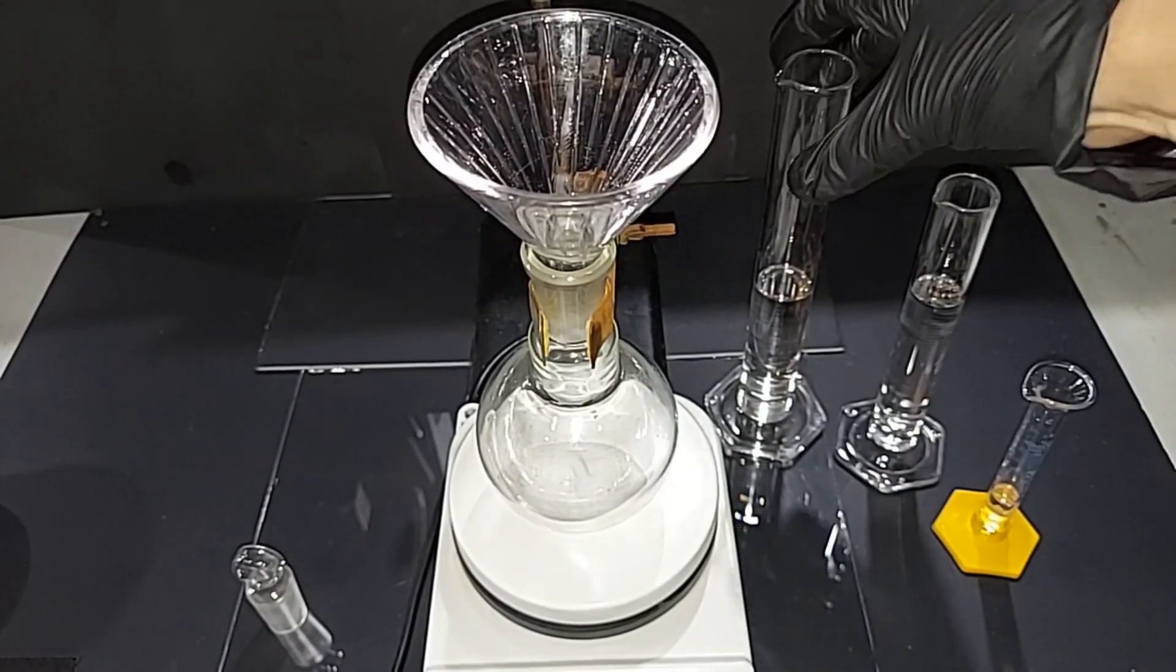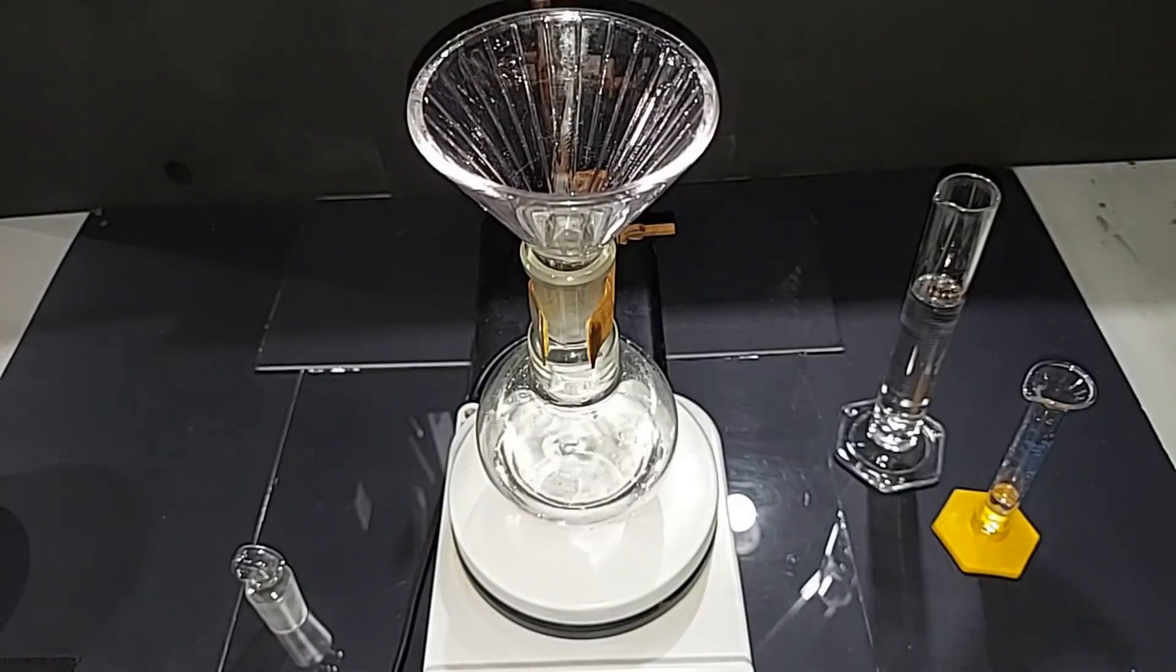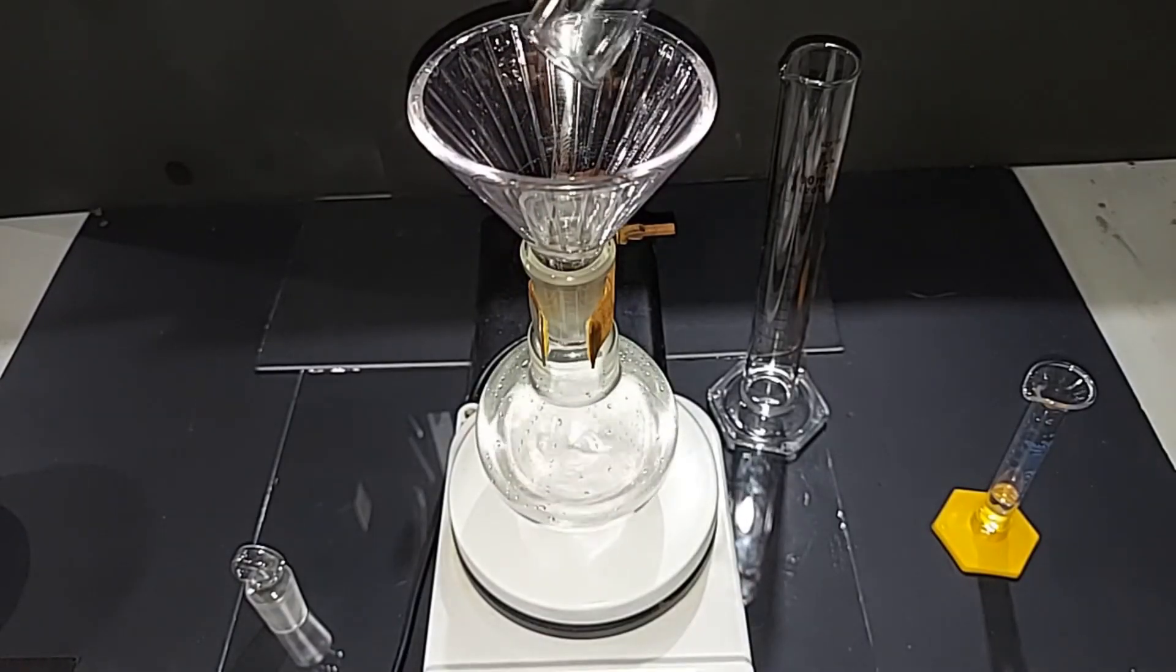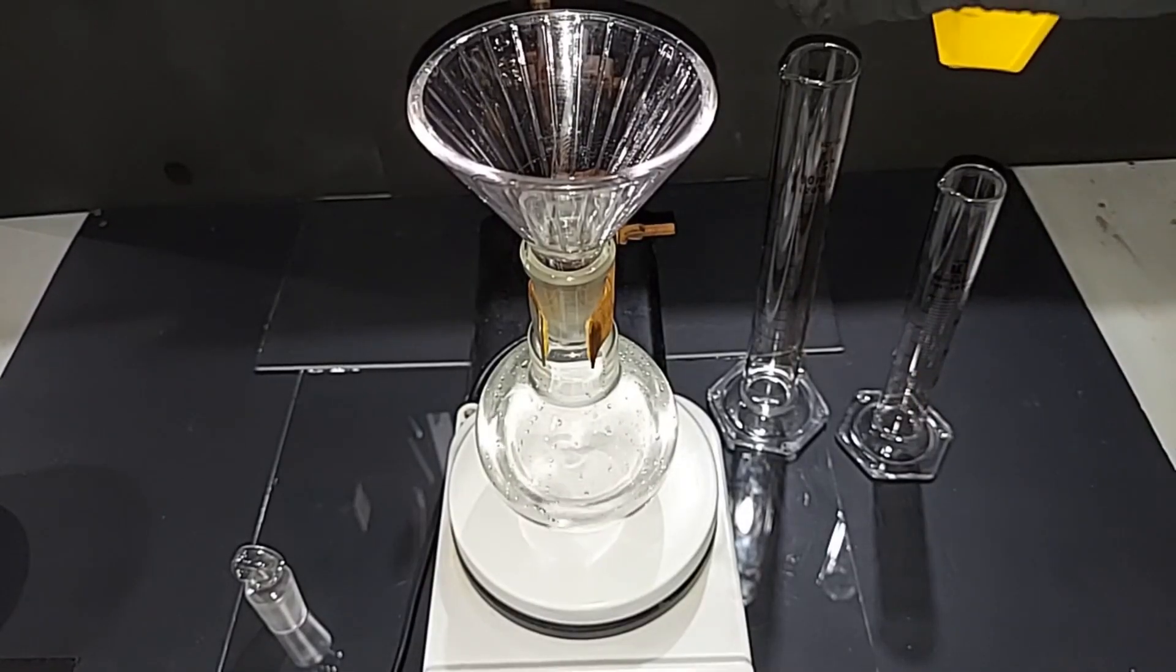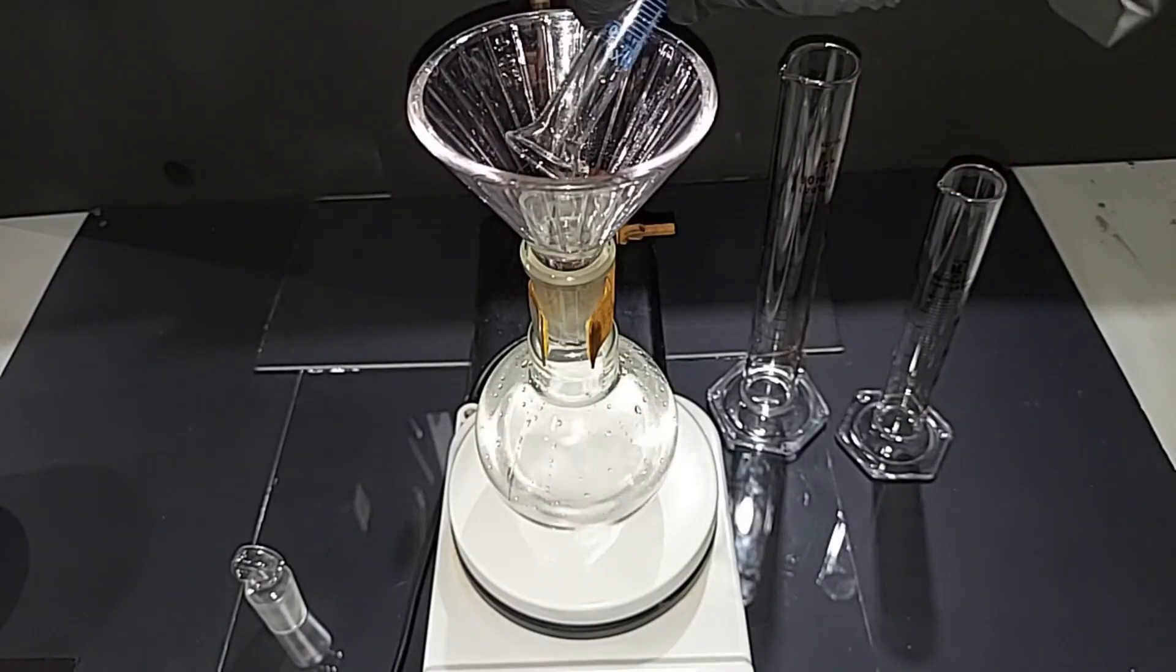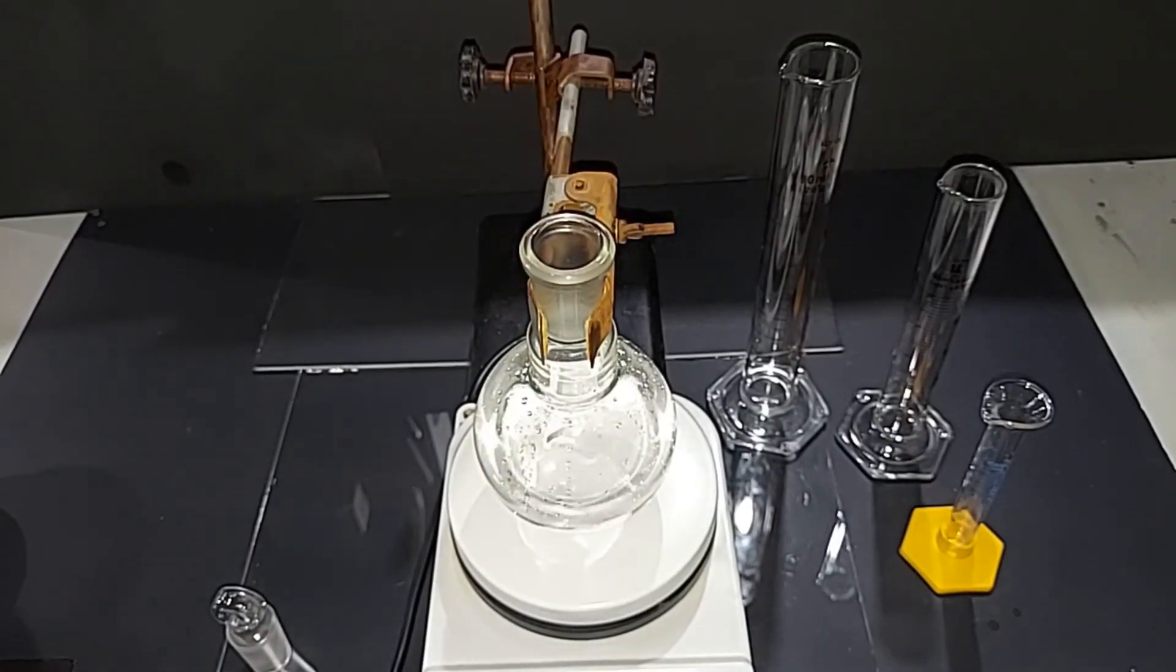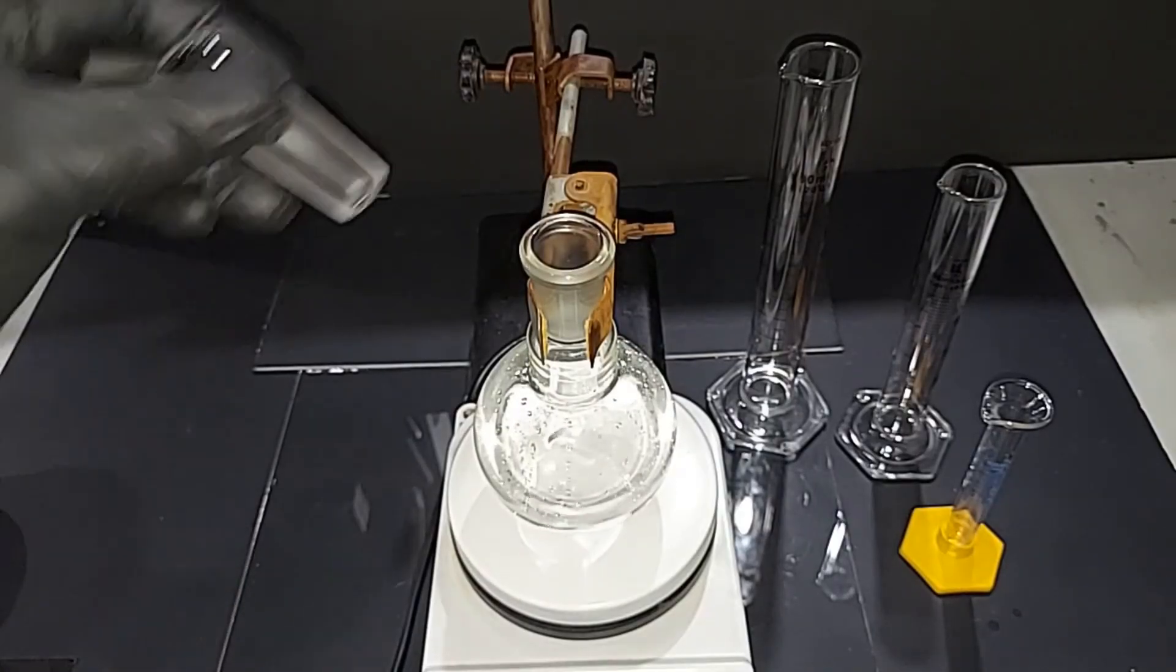I'm going to start the magnetic stirrer. First thing I'm going to add is the ethanol. Next, the glacial acetic acid. And lastly, and a little slower, the sulfuric acid. Lastly, I'm going to cap this, not because I'm going to leave it overnight, but it will take me a bit to set up the next step.